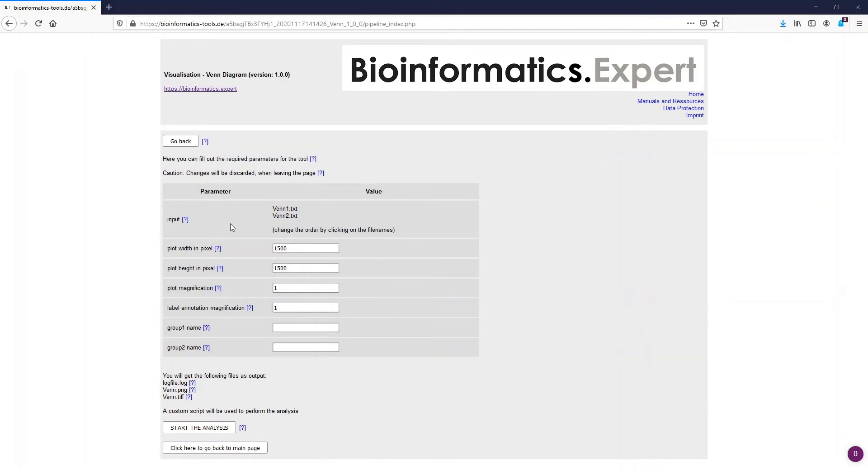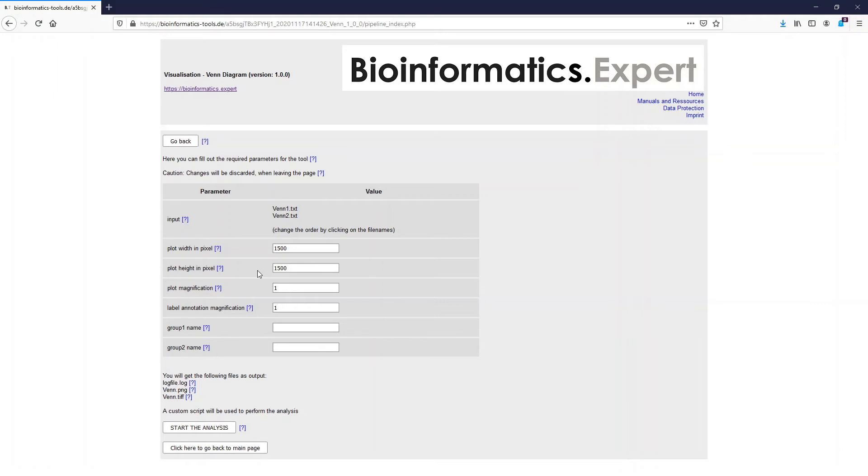Similar to the PCA program, we can now select the plot width and the plot height in pixels. 1500 and 1500 is given here. That means we get a quadratic figure now. If you want to create larger figures then just increase this number.